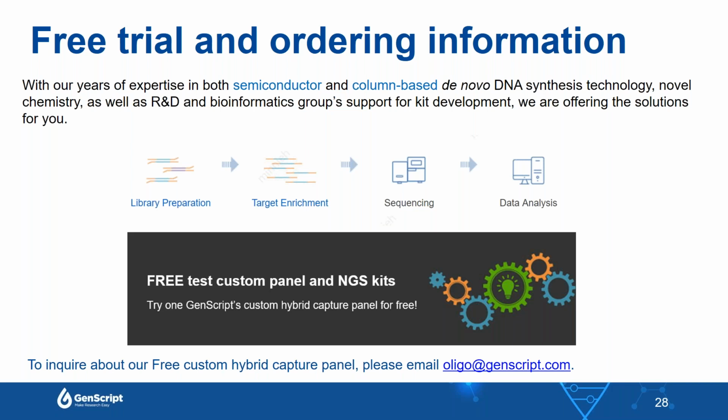Sure, that's a good question, and thank you for that. Currently, we do not recommend our customers to use oligos from our chips to do amplicon sequencing, although we do have experience with helping a few customers do that successfully. There are some special considerations that go into our production when we manufacture amplicon primers on our chips.